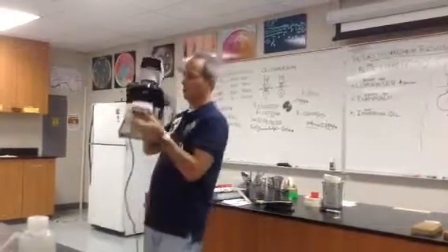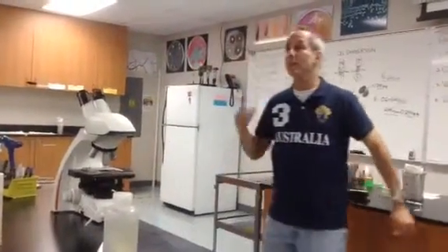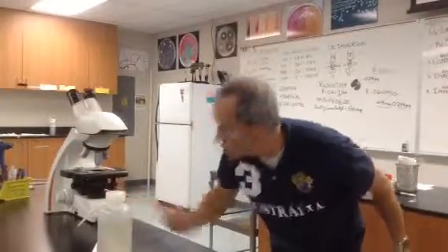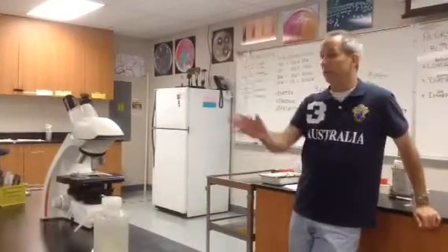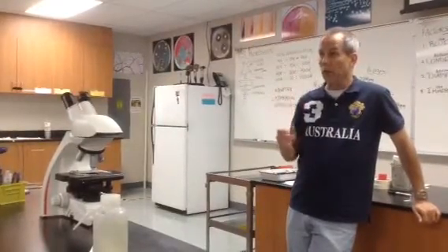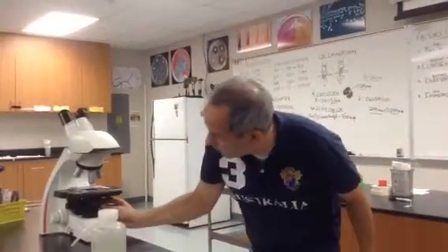Agreed? Okay. It's a shame that when people are getting tested on their gram stain practicum, a lot of times people will say, well, I guess I'm just going to get a 0 because I can't get this to work. And I can look and see that they don't have this set on 100. But I can't go in there and do that for you. I'm not allowed to touch that. So it's an exam after all. So they're going to take a 0 just because they didn't know to set this at 100.